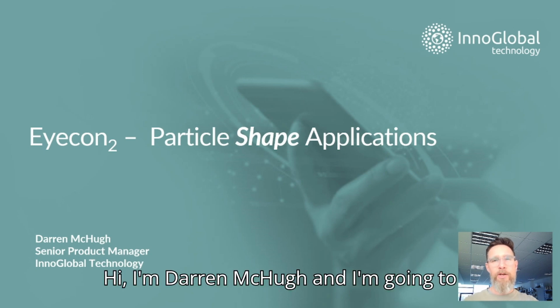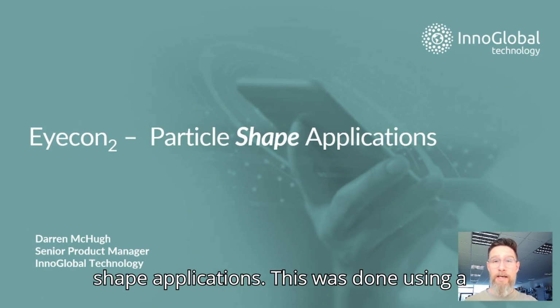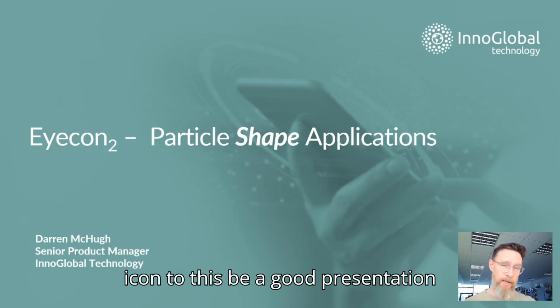Hi, I'm Darren McHugh and I'm going to give a presentation today on particle shape applications. This was done using a direct imaging non-product contact particle size and shape technology, the Eyecon2.